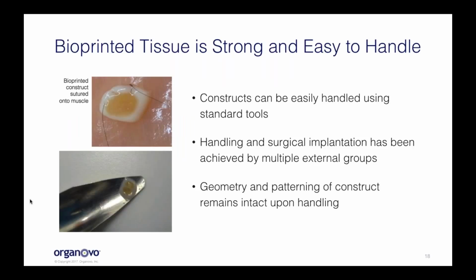So this really here is fundamentally at the basic level what we think you would need to see. That is a defined area of non-parenchymal and parenchymal cell population. So you can see the hepatocyte-rich region in this tissue. This is obviously the most fundamental geometry that one could think about, but it meets all of the basic demands for our preliminary experiment.